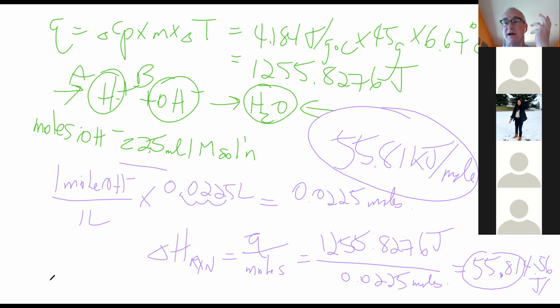Now, remember, it's not going to add up exactly because we've done some deviousness with the math here. We've assumed that we have a certain mass of water when we probably don't. So that is going to change our results slightly. But you can see it's really, really close.